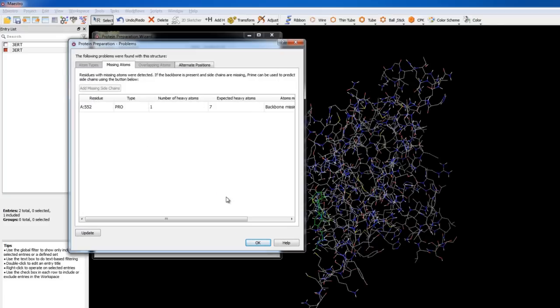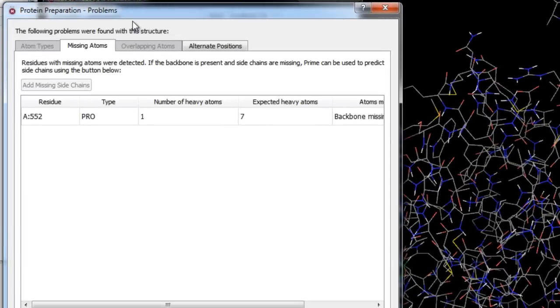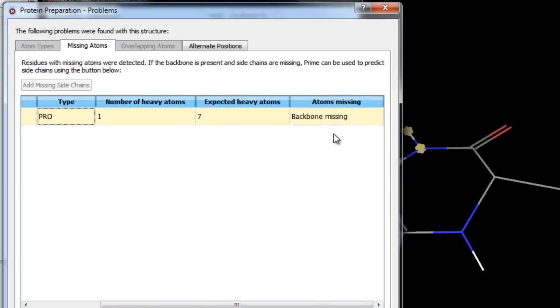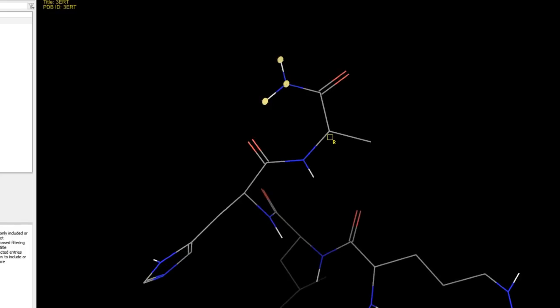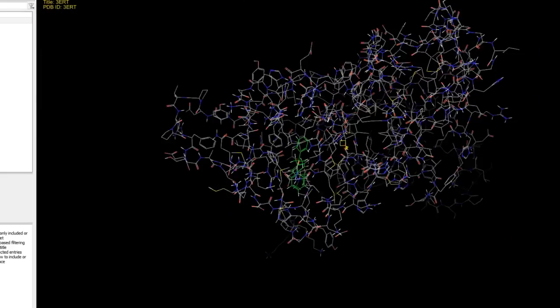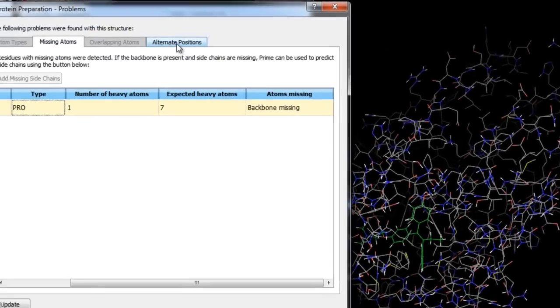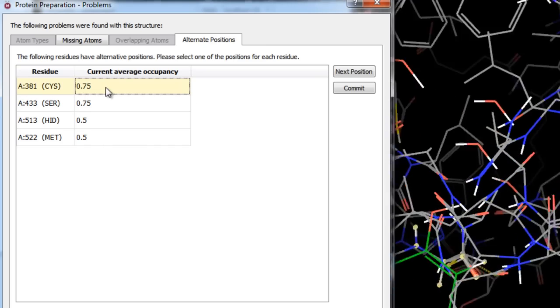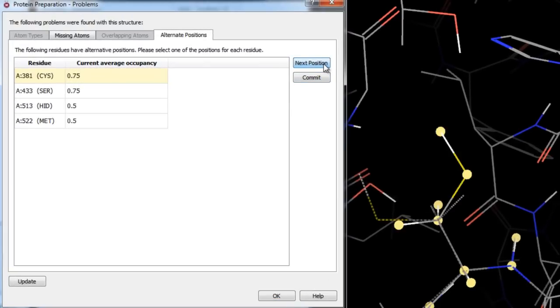Once pre-processing completes, a new entry is incorporated into the entry list and workspace. The Protein Preparation Problems dialog alerts us to potential issues with atom types, missing atoms, overlapping atoms, or alternate positions. Here it states we have a proline with missing backbone atoms — Prime only fixes missing sidechains automatically. Since this proline is far from the binding site we can safely ignore it. Alternate positions are also reported; in the Problems dialog we can switch positions and see average occupancies change. By default the position with highest average occupancy is used, so we'll click OK.